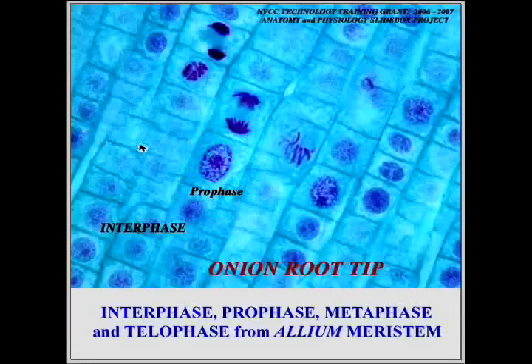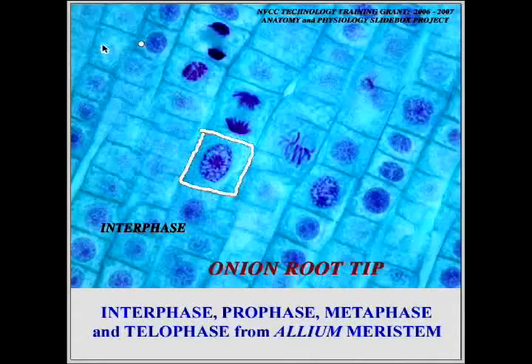Now, one of the reasons why students like plant cells as opposed to animal cells in their initial studies of mitosis is that the delineation, the sharp boundaries from one cell to another are most apparent. Don't forget that plant cells don't just have a cell membrane. They also have another form of that, known as the cell wall, which imparts a certain rigidity to plant cells. Yes, I know it's an anatomy and physiology class and we're not going into plants, but this is a plant. This is plant tissue that you're looking at right now. So when you look at the animal tissue from mitosis in the slide box, the delineation, the demarcation, the boundaries of these cells may not be as apparent as you see so nicely here.